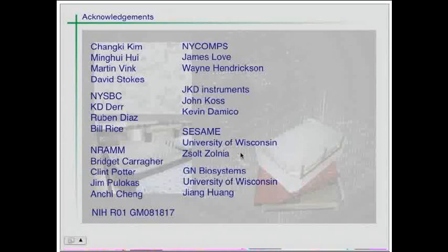The way that you were scoring your trials, you had a whole bunch of representative images up the top, and you were indicating when you had proteoliposomes, sheets, tubes, and this sort of thing. Then you showed all the results that you got with your protein. You had a lot that had sheets and large proteoliposomes. Is there any discrimination between your range of the protein within those? Were all of those proteoliposomes ordered in an array, or were some of those sheet-like structures without order? No, many of those that showed sheets or tubes, most of those showed either tubes with parallel edges, but no diffraction.